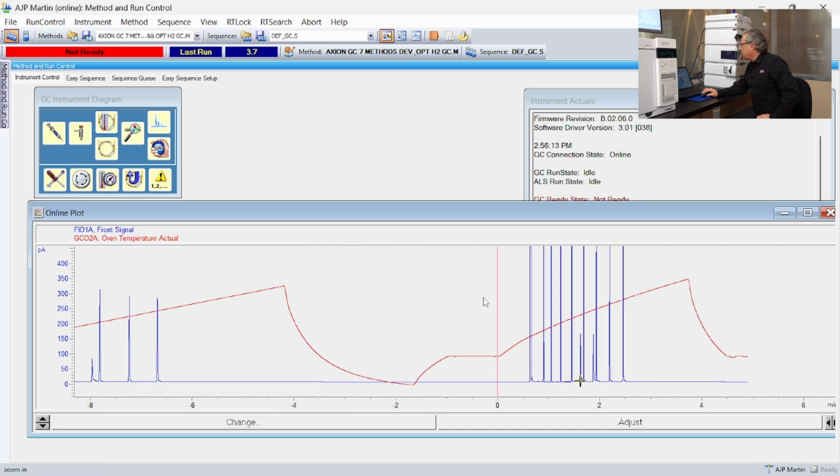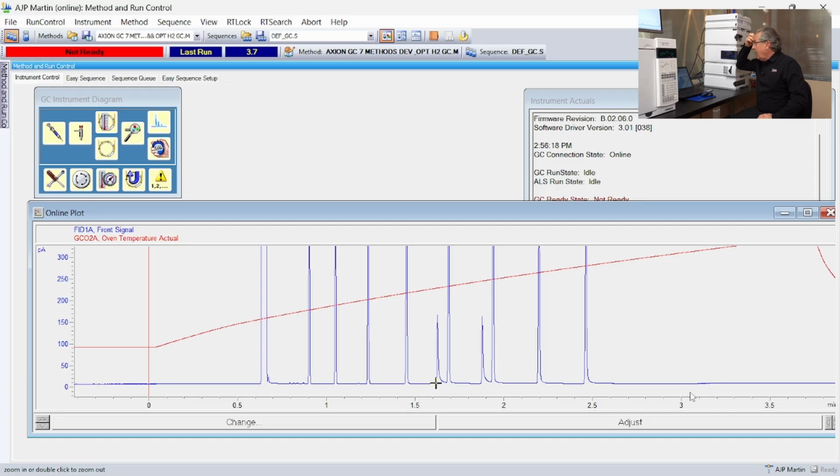One last little trick I'll show you, and that is if you look at your chromatogram and look for the biggest empty space, because the biggest empty space is where you're going to be able to gain the most speed. So in this case, the biggest empty space is nowhere in the chromatogram. It's before the first peak. It's before T0. Now, I know what you're thinking. Well, I can't move this first peak any further in because I'm afraid the other peaks will move in.